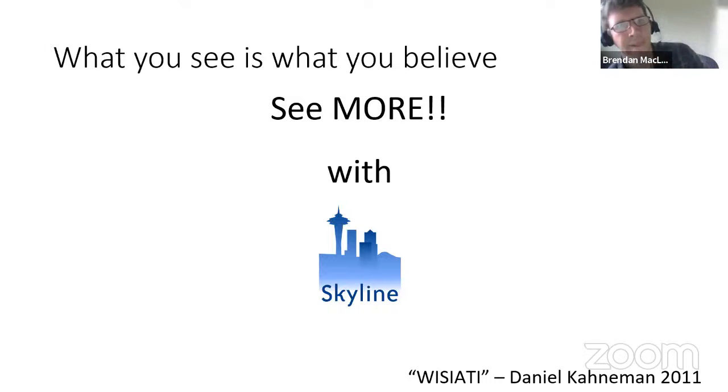So that's the design of Skyline, and what makes it unique is that you can go that entire range from large scale DIA or DDA all the way down to a very targeted method that you're going to use for SRM or PRM. Another big thing about Skyline, which Lindsay pointed out yesterday, is that the only tools on the list for DIA that allowed you to just look at your data were Skyline and Spectronaut. That's been something Skyline has offered from the start, and we continue to focus a lot of our effort on really understanding your data and being able to see with your own eyes every aspect of your data that we can come up with.